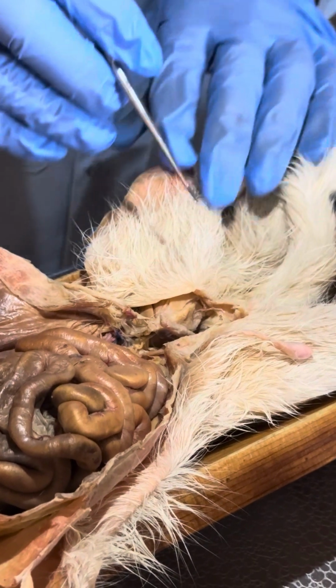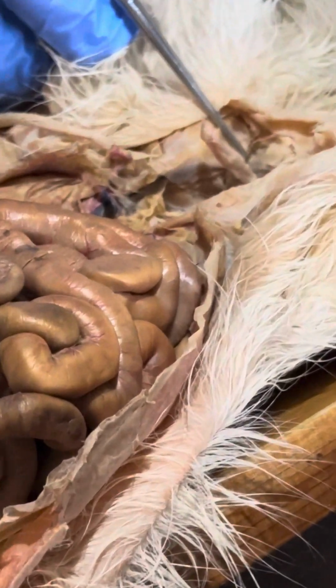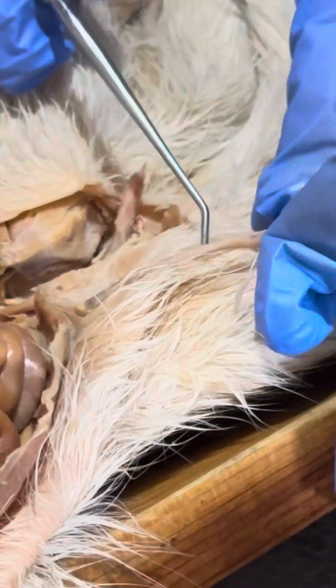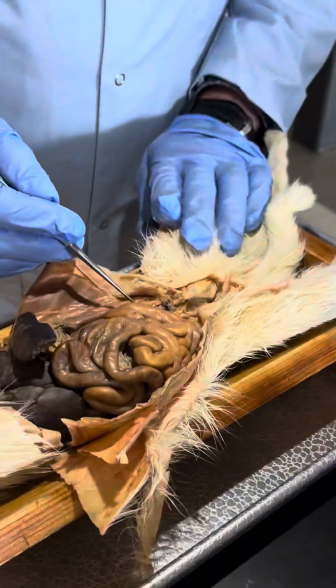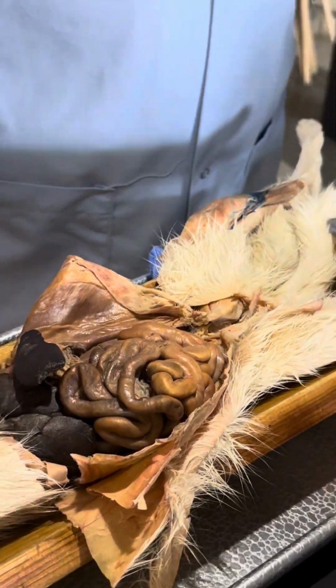Okay, so we have glans, shaft, crura or crus, bulbourethral gland, prostate gland, urethra. We have the testicle and a fascial sac, the spermatic cord and the spermatic fascia, and then inside we have the vas deferens. So now I'm going to get a female cat over here.